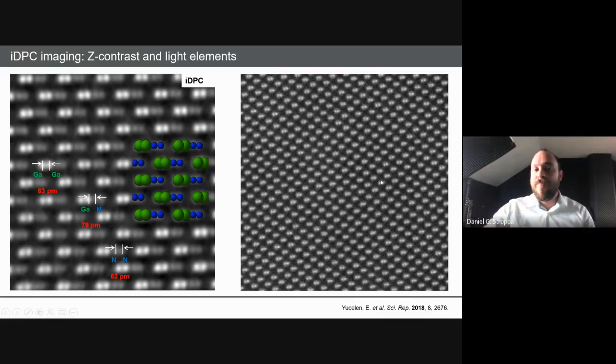And then just to finish, this clever use of the detectors allows us now to see even hydrogen atomic columns. So we can see hydrogen atoms in the TEM using this because of this contrast that we played smarter with the detectors, and allow us to see very beam sensitive samples that can only survive a very small dose, a very small amount of electrons.